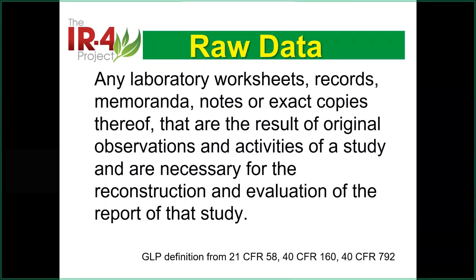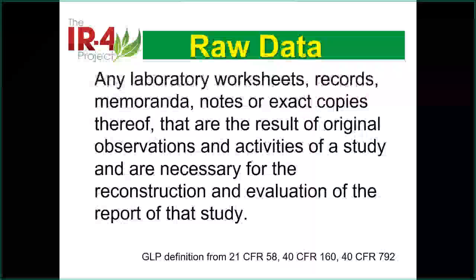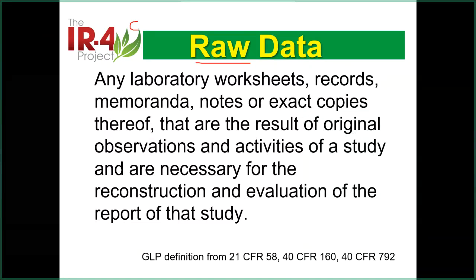Let's start today's work. We talked about a lot of things about data yesterday, so we are going to use the law, the GLP law, to say this one more time. So what is raw data? Sometimes we call it raw data, or put another word there to make it more restrictive or easier to see, so call it original data or original raw data.